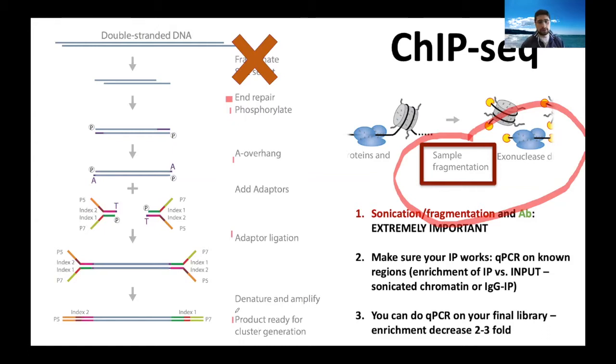What I usually do is I go ahead and prepare the library, and just by doing amplification with the PCR at the end, I usually increase the amount to a lot of nanograms, and so at that point, I have a lot of material which I can test.